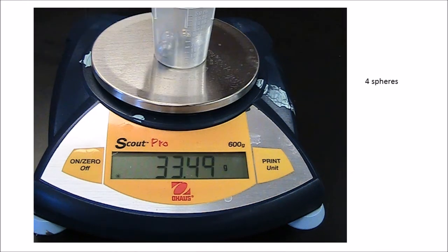Then we're going to throw in some others. It doesn't have to go 1, 2, 3, 4; it's better if you stretch them out a little bit. So here I've put in 4 spheres, right there, and if you look in here, there's 1, 2, 3, 4 of those. Their mass is 33.49. I write down, that's 4 spheres, 33.49 grams.